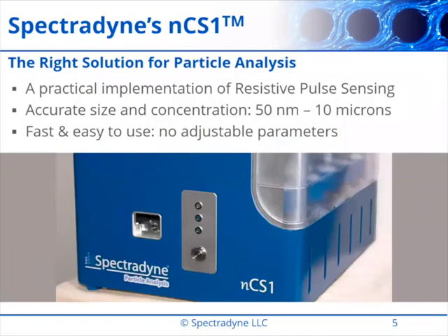Now, many of you probably have heard of resistive pulse sensing as the Coulter principle. It's basically the same thing. Coulter counters have been around for many decades. Beckman Coulter obviously sells them, and they are very good for measuring larger particles like cells. The problem is when you try to miniaturize that technology to nanoparticles, which are obviously much smaller and usually much higher concentration, you can have various problems.